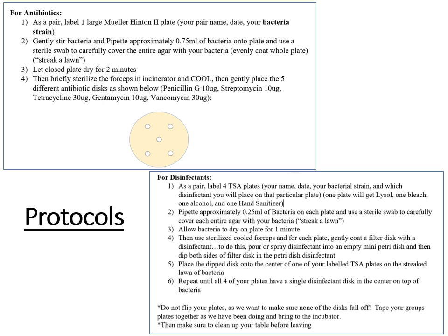Sometimes we use hydrogen peroxide, mouthwash, all different varieties of disinfectants and antiseptics. You then place those discs on the swabbed bacteria and look to see, do you get a zone or do you not? For those, you're not even measuring. There's no pre-made table. You just simply look: is there a circle zone of inhibition or is there no zone, to see how effective that disinfectant would be.